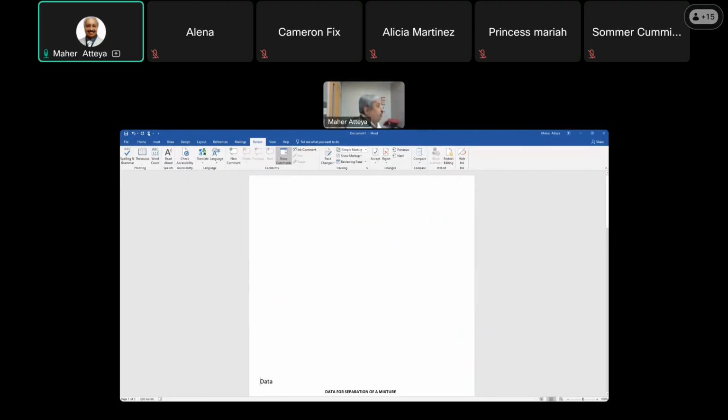So we'll be using their physical properties. What are the physical properties? The physical properties are as follows here. Ammonium chloride has a sublimation feature that both the other ones, sand, silicon dioxide, and sodium chloride, kitchen salt, don't have. So this one will use its sublimation feature, sublimation. So sublimation is the physical property, okay? Sublimation as a physical property.